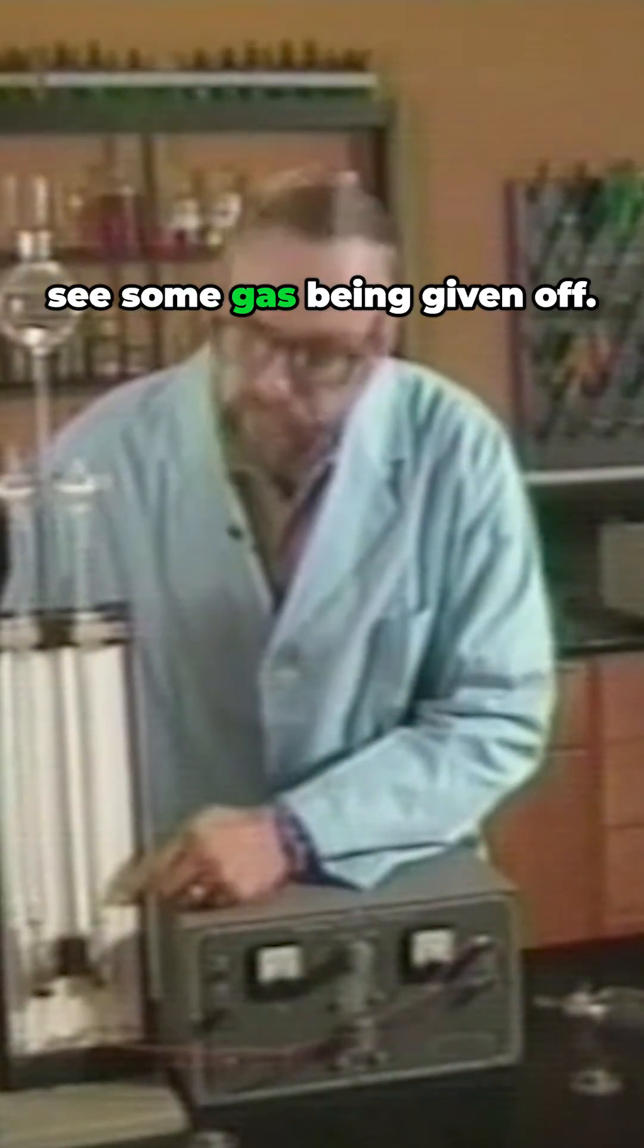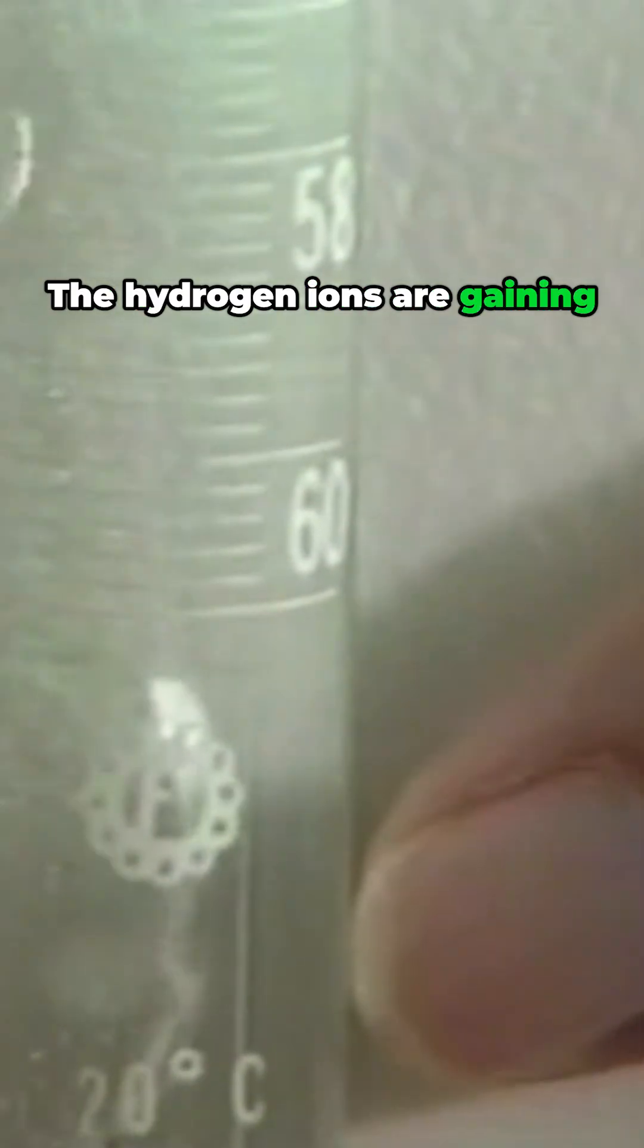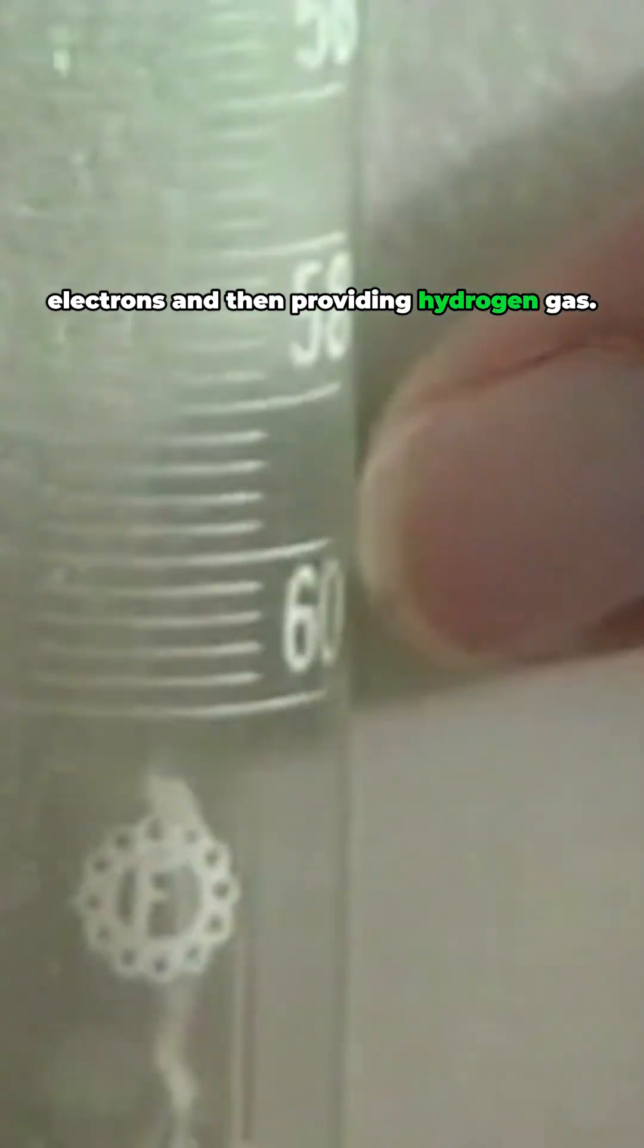At the negative electrode, we see some gas being given out. That's hydrogen gas. The hydrogen ions are gaining electrons and then producing hydrogen gas.